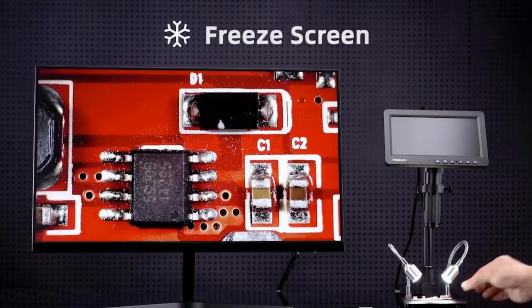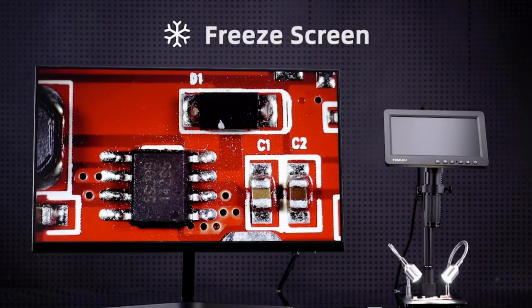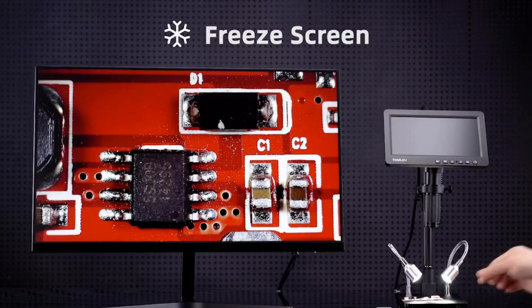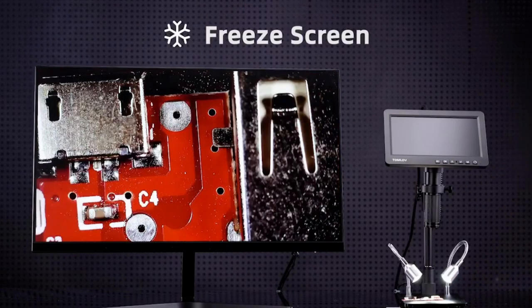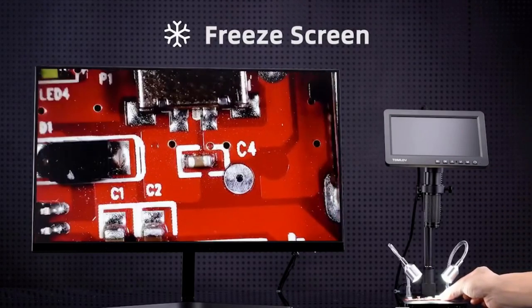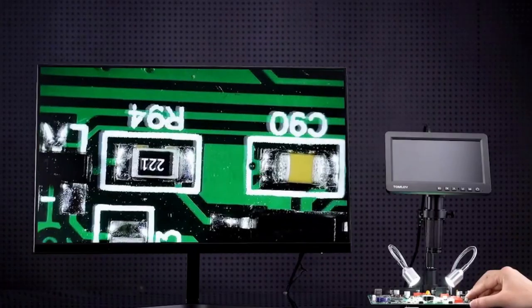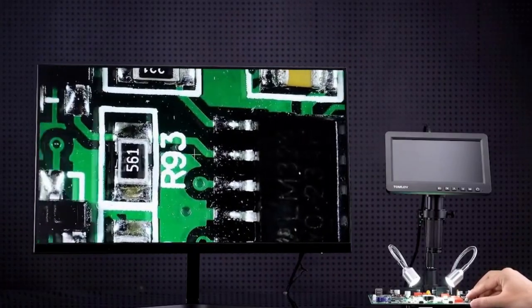Tomlov hasn't held back on convenience. The versatile remote offers a range of practical features including quick capture, image flip, enlarge, magnify, crosshair, black and white, freeze screen, and more. This means you're in complete control of your microscopy experience.